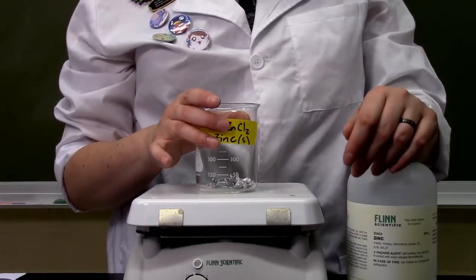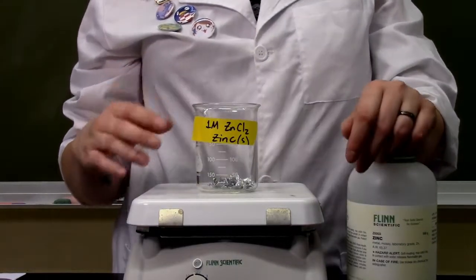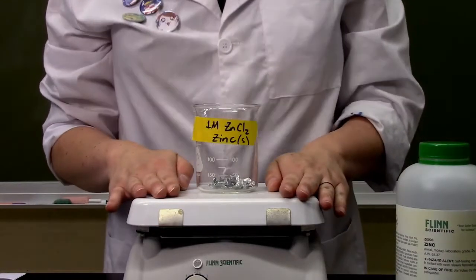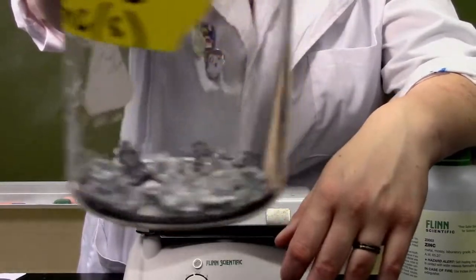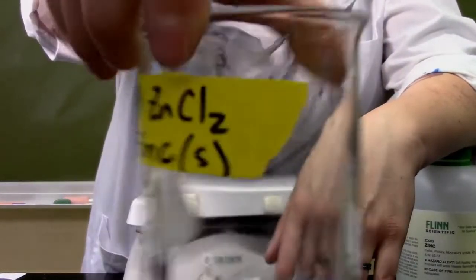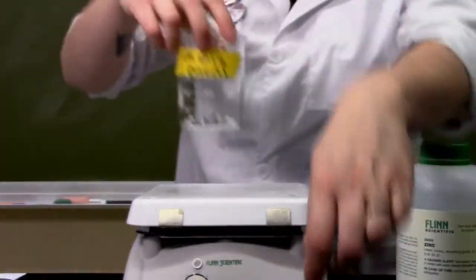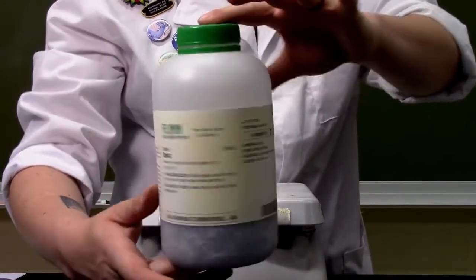I've added solid zinc to the base of the beaker. I'm going to lean forward and show you the inside of the beaker. I feel comfortable doing that because, y'all, at this point, the hot plate is totally chilled. All right, let's look inside. So this is a form of solid zinc called mossy zinc. You can also get zinc in a very powdered granular form. This is big chunks of it. And I've added just enough to coat the base of the beaker. It comes in these big ol' chemical reagent bottles.